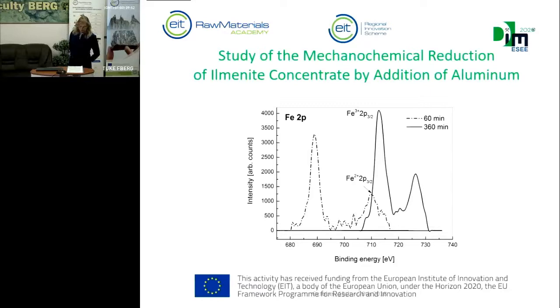have demonstrated changes that are caused by the mechanochemical reduction in the surface stoichiometry of the products. The detailed spectral lines of titanium and iron confirm the creation of the amorphous rutile phase according to thermodynamic predictions.